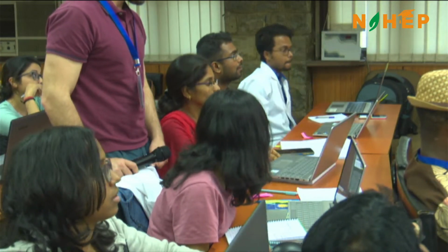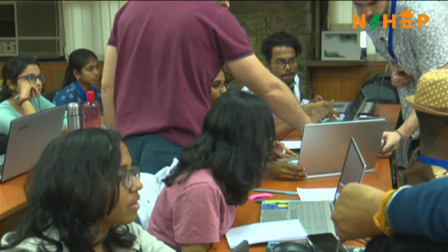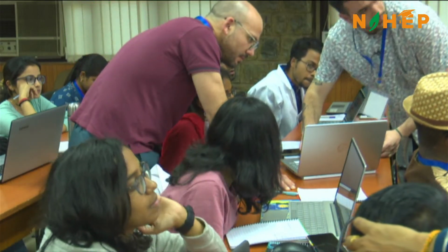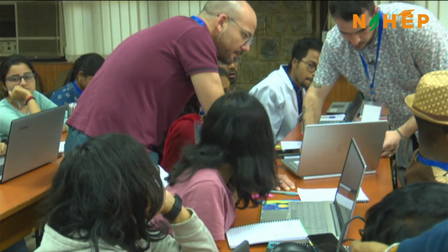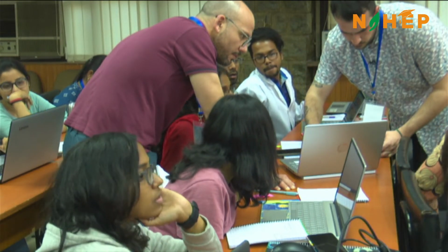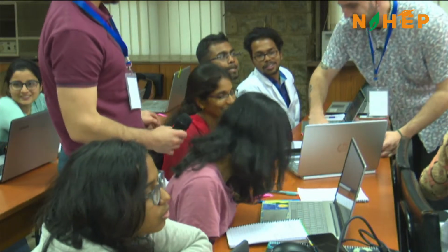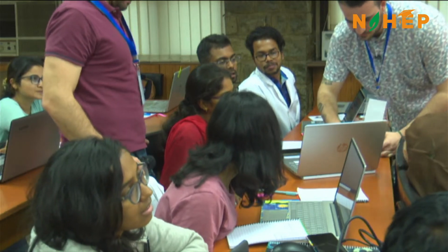Detail of the environment. It worked, but then it's not popping up the figure. Do you think it's something with aesthetics? Because she's not running the 181, right? She didn't run the whole thing. She just ran one line. Oh no. I think you deleted half of the chunk, maybe by accident. Because now the plot thing is not there and it should be there. So maybe we try Control Z.